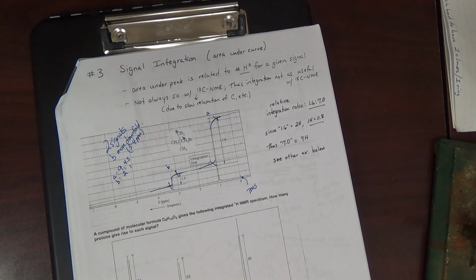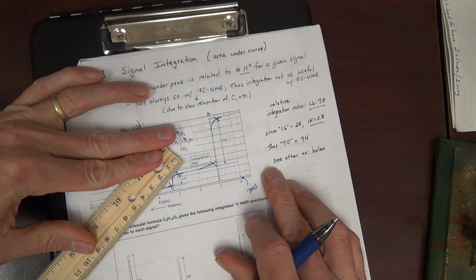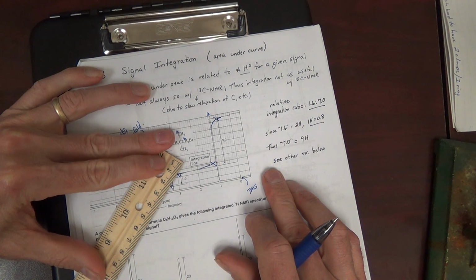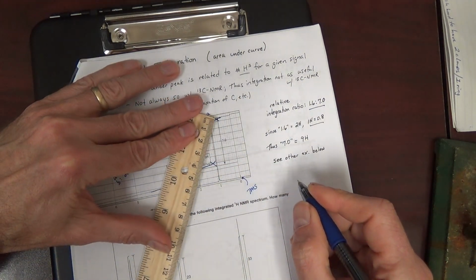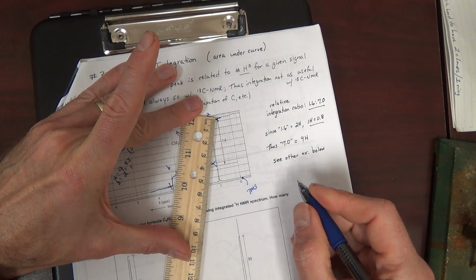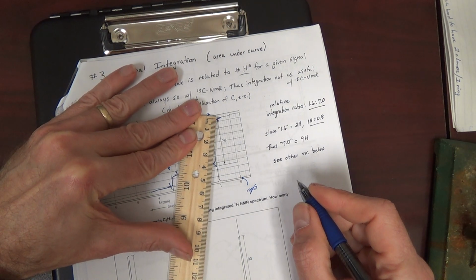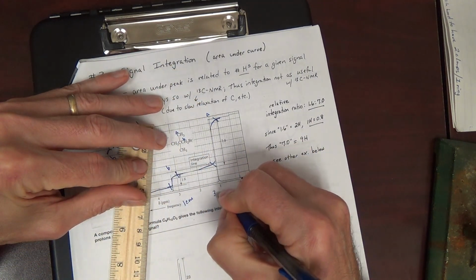You actually pull out your ruler and say that this was, I'm going to say, 1 centimeter, where this here was less than 4.5, it's like 3.8 centimeters.